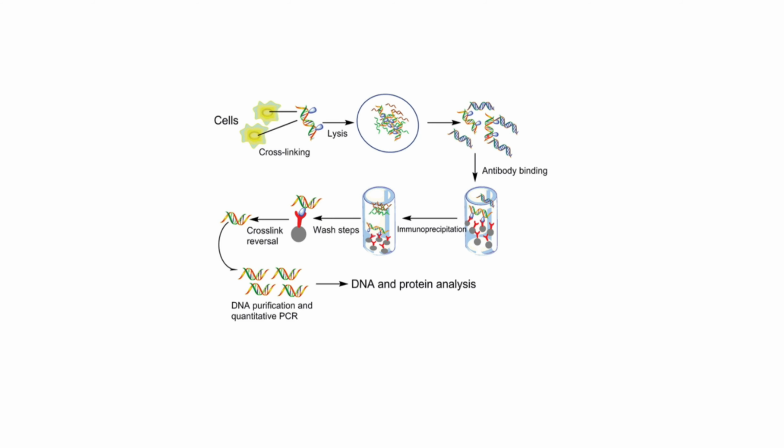the protein may bind to a specific DNA fragment but not others. The next step is to design an antibody that will bind specifically to this protein-DNA fragment. Then we wait for the connection between them, and if a DNA fragment doesn't have the protein, it will not be kept. The next step is washing, which removes all of the DNA that doesn't have the specific protein. Then we collect them and sequence them, just like the normal sequencing step.